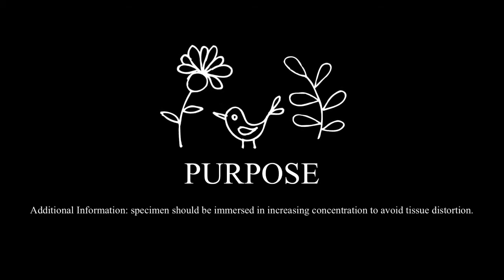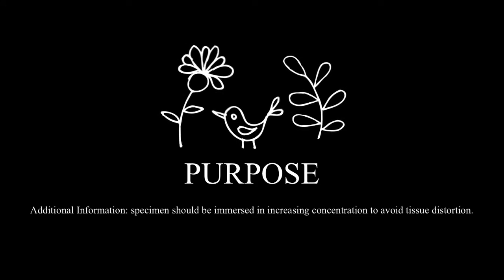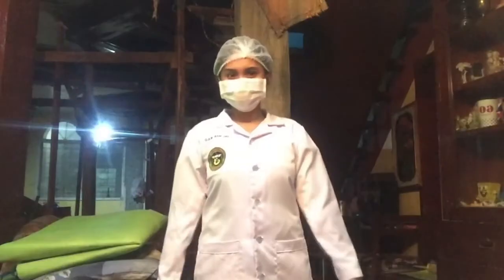Now, this water is removed to avoid further changes and other complications that may arise in the following steps. Not only may it cause complications in other steps, it may also lead to the degradation of the quality of our results. This is Rona, and this has been your dehydration process.